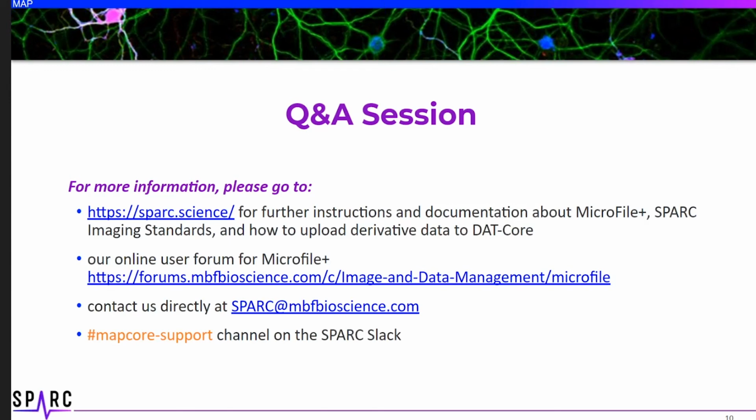Sue, what I'd say is OME TIFF really provides a standardized way that microscopists have agreed upon to save metadata within the file, whereas it's harder to specify that from Photoshop as you're saving TIFFs. That's my understanding as well. It's the metadata. It's the part that you don't actually see that is the different structure.